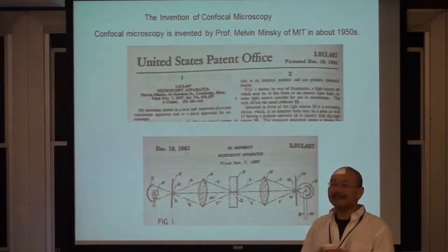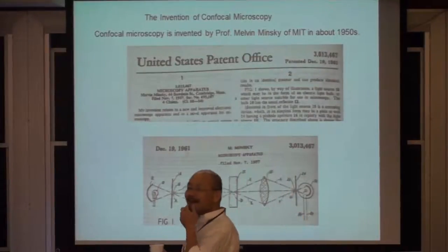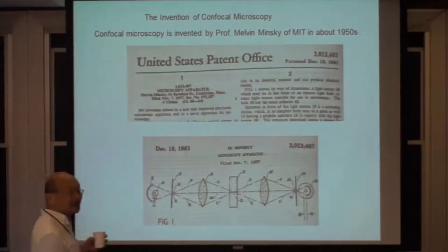On the other hand, sometimes it is good to invent something, but sometimes inventions are a little bit before their time. In fact, if one looks at the history of confocal microscopy, you will quickly find that after the invention by Dr. Minsky, it was quickly forgotten. And then actually, confocal microscopy did not become commercialized until the 1980s. So one of the questions is, why didn't Professor Minsky's invention work?